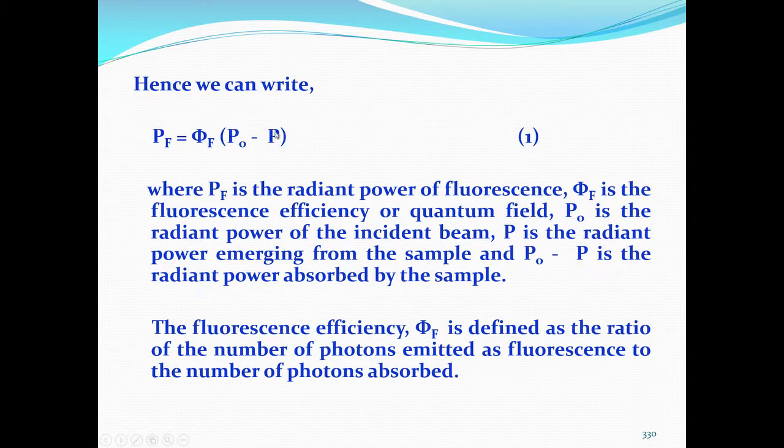If Qf is 1, it will be 1, but if Qf is very small, the total fluorescence of the substance will be quite low.